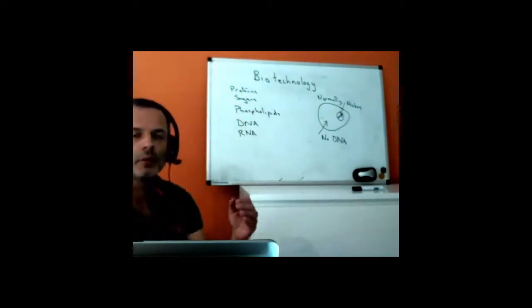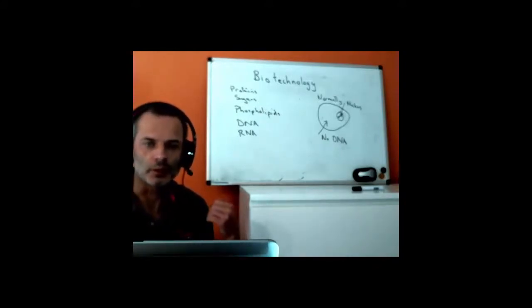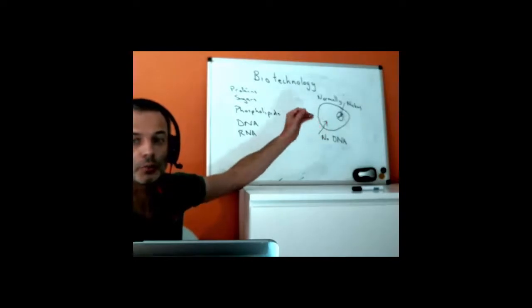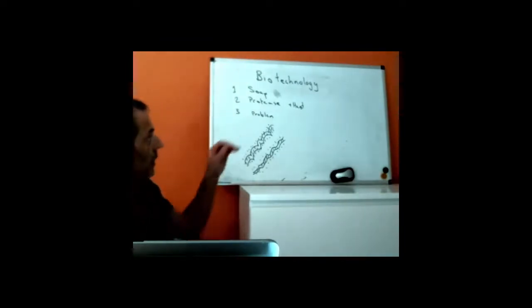So what we're going to do is add a protein that will break down proteins, sort of traitor to its kind. That will be a digestive protein that will break down proteins into smaller sections so they don't work, and it will break specifically the DNAase, whose normal job is to stop DNA from getting into the cell. The protease has another function actually.